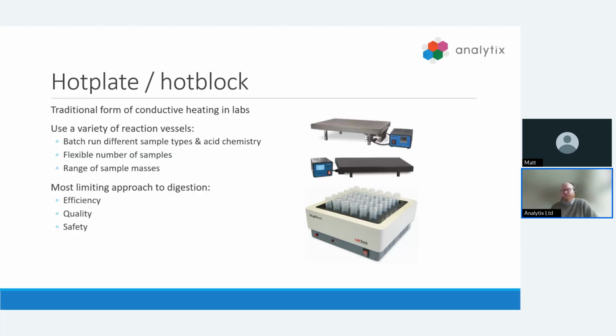This approach is probably the most limited in terms of sample preparation approach. It's very time consuming. For most applications, it can take hours, potentially days for complete digestion. However, we do see across the market that there are some applications where this is quite quick, in minutes as opposed to hours for complete digestion. But as a process, it is quite labor intensive for users as well, so that needs to be taken into consideration.